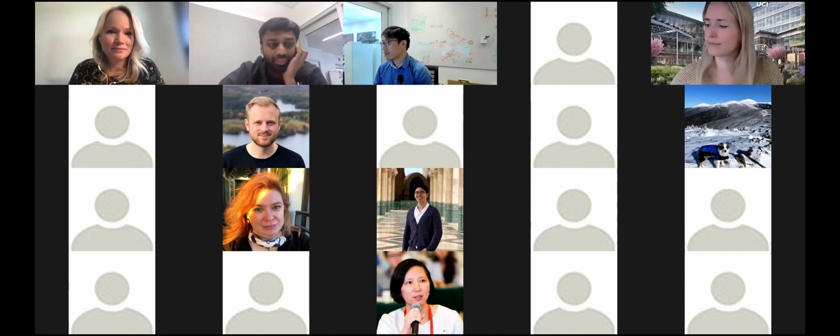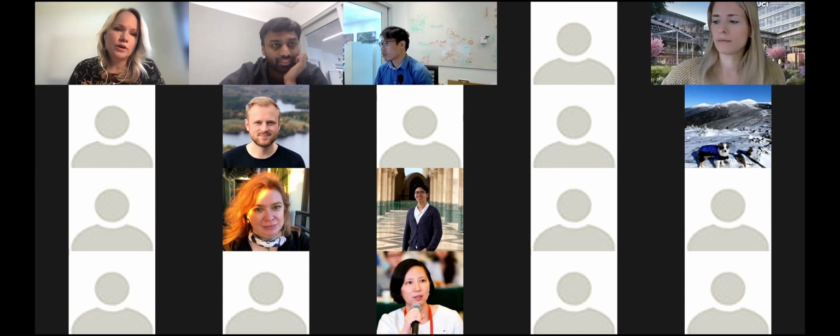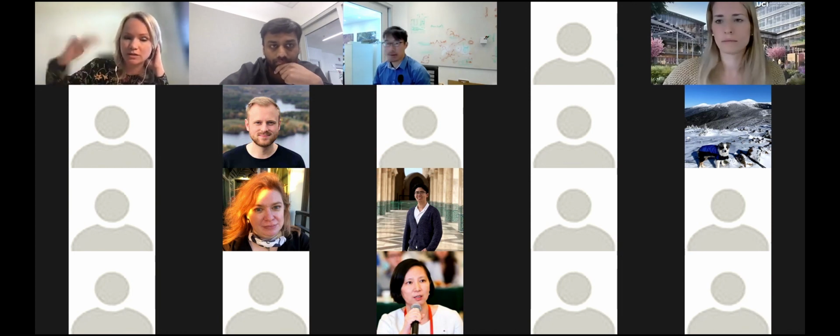Do you think a third dimension in your image acquisition would help with better resolution of localization, or do you think you're capturing most of the protein localization in 2D? We're capturing most. Actually, we do acquire some z-sections, and sometimes you cannot capture focal adhesions and nucleoli in the same section with confocal. That's just not going to happen. So then we take several sections to capture that.